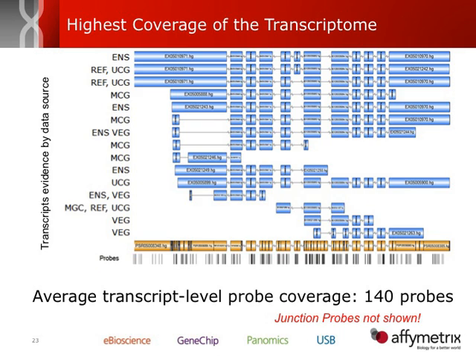This first one comes from Ensembl. The second one is in both RefSeq and UCSC. You can see that all of these known isoforms are from multiple different data sources. If you were looking at a single data source or a single database, you might see only one or two of these isoforms, but potentially miss the isoforms that are in the different databases.